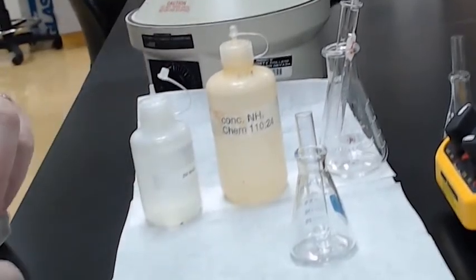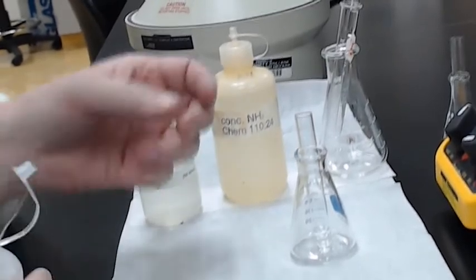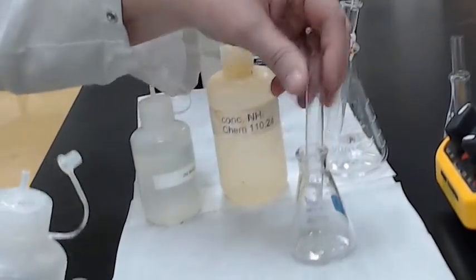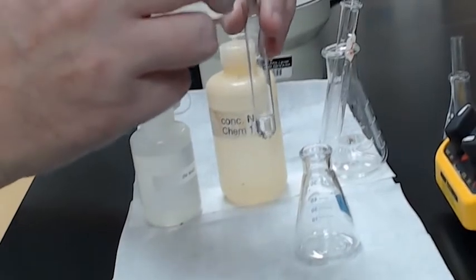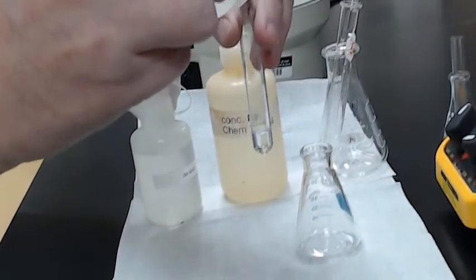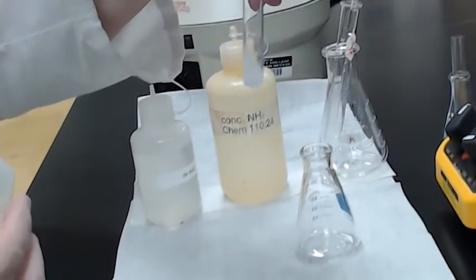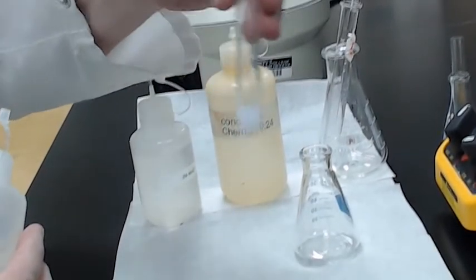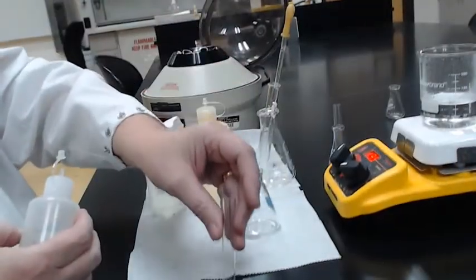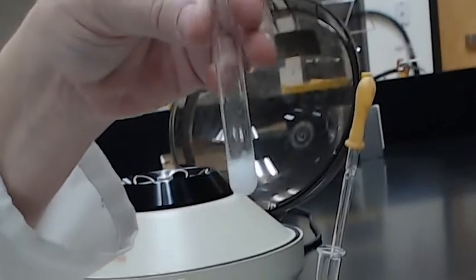So we've created a buffer solution that in an ideal situation won't touch the magnesium. And so only calcium and barium should precipitate. And we're supposed to add enough drops of this until it stops precipitating, which is kind of a trick. So as you saw, we made a precipitate. I'm going to hold it up against something dark. There we go. You see it made a precipitate.